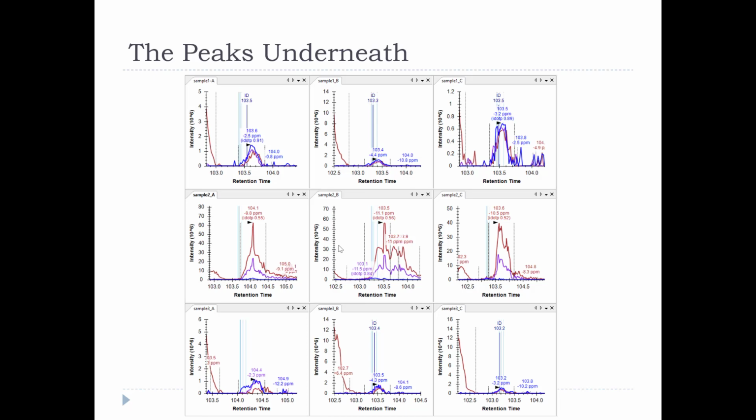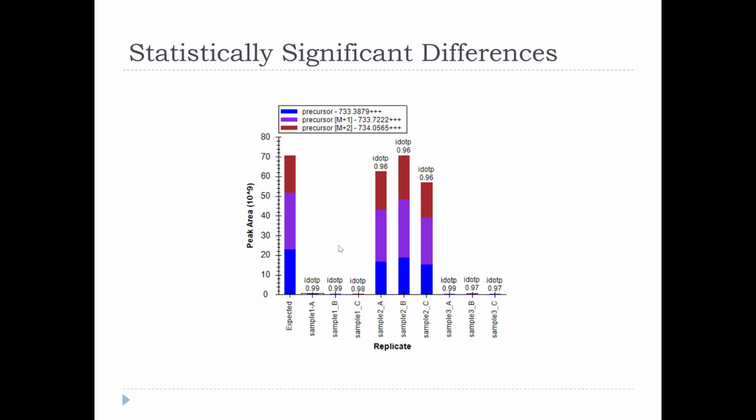So there's potentially some chromatographic separation between what's getting picked by Skyline, but it would be really hard to get. And that's one of the things DIA will give us: the ability to use fragment ions to separate these two different precursors. There's no tool, MaxQuant's not going to do it, none of these tools are going to be able to give you a really good peak area for this peptide in this case.